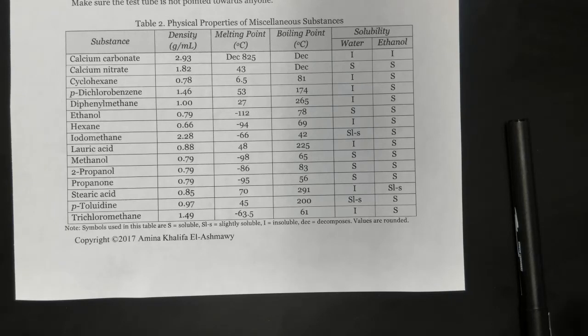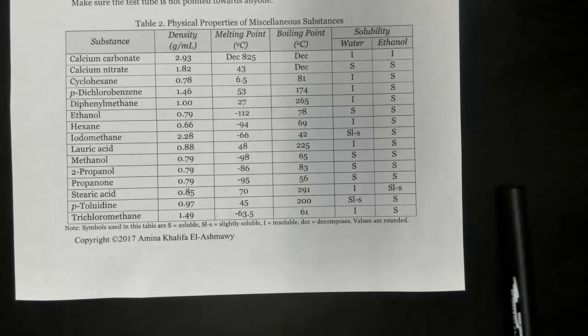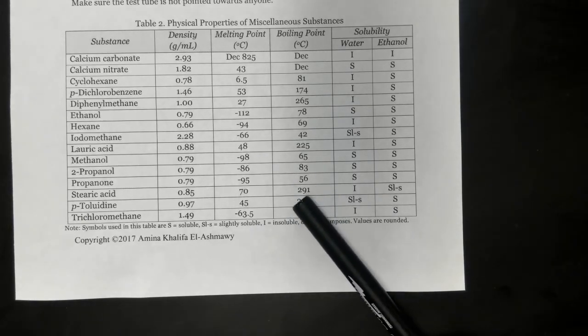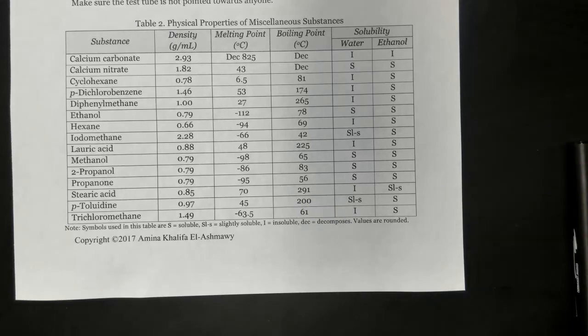Okay? And you have keys down here to help you out in interpreting this table. But you'll need this table to compare with the data that you acquire from the experiment to identify your liquid and your solid.